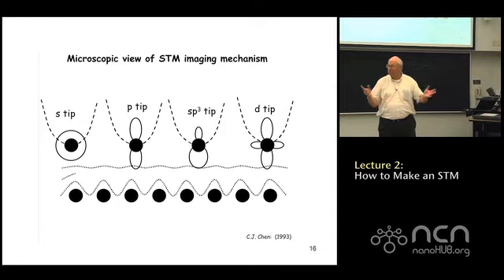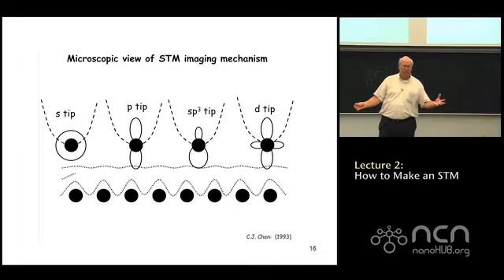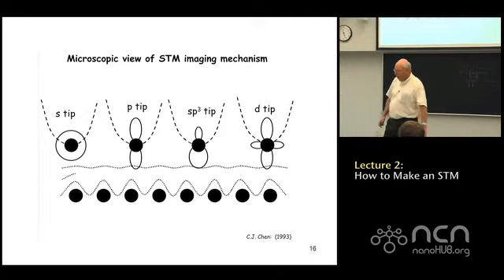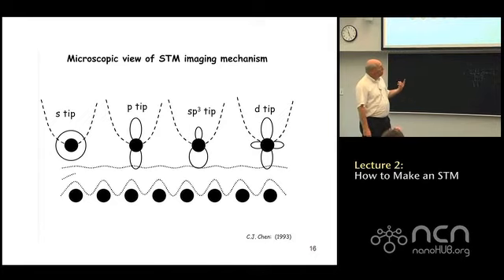It's an inference. They say, oh, the atom on the end of this tip on this day was in, let's say, an sp3 state, right? It's not very convincing, but that's the best we can do. Yeah. So the material of the tip also... The material of the tip is important, right? It's a typical material. Depends on what I want to see. Yeah, so the question is, what is the tip typically made from?